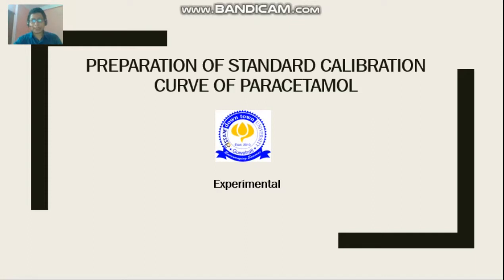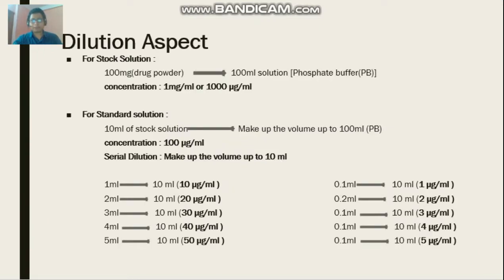So coming to the experimental part, here we will give you an idea how the continuous dilutions are made to prepare the sample solution, and after preparation of the sample solution, how this sample will be evaluated in a UV visible spectrometer with a demonstration.